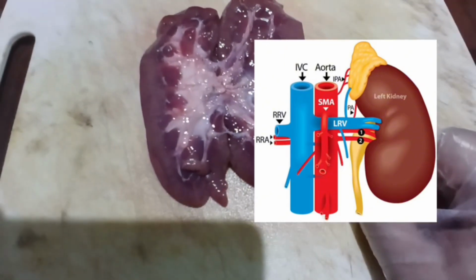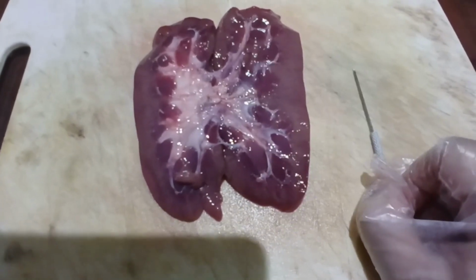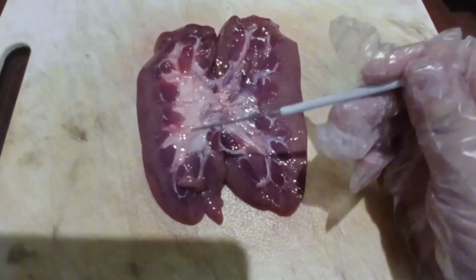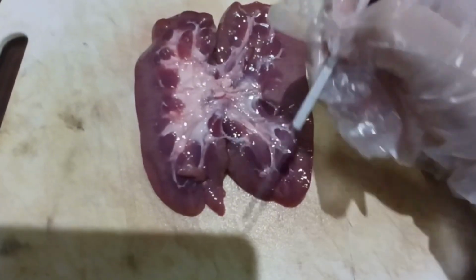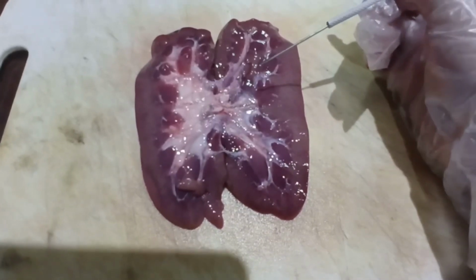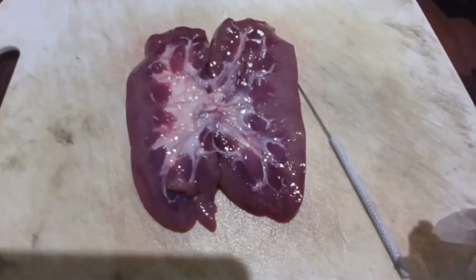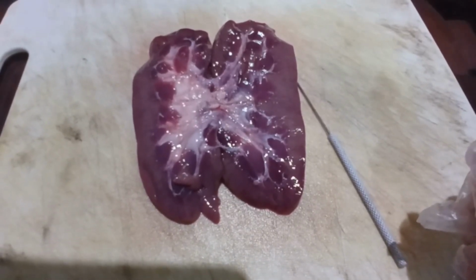So in summary, the blood flow of these renal veins is good for the filtration. The kidneys, or the renal veins, are the ones that return filtered blood to the heart, and the pathway vessels in the kidney are the ones that give the filtration, reabsorption, and secretion processes, as stated with the earlier functions of the parts of the kidney. And of course, after this being drained from the inferior vena cava, it goes back to the heart and the process begins again. So the flow of the kidney is, again, essential for our fluid and electrolyte balance.